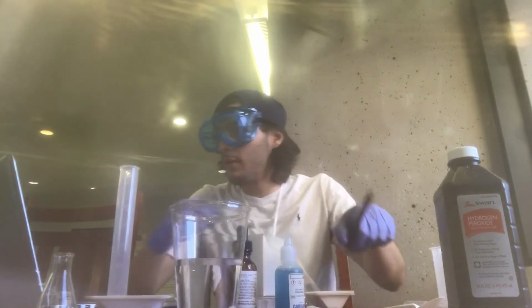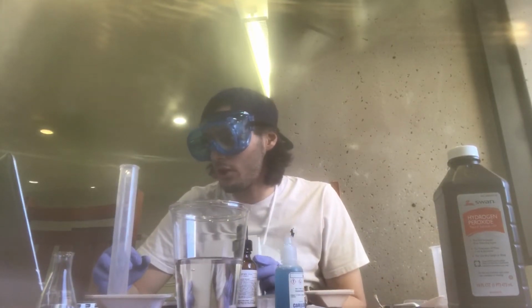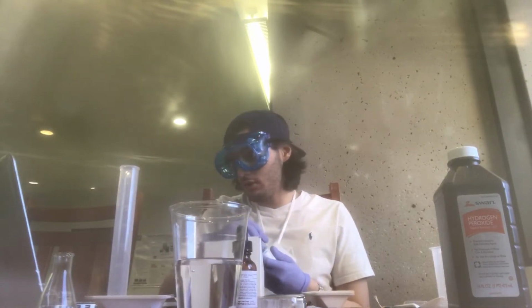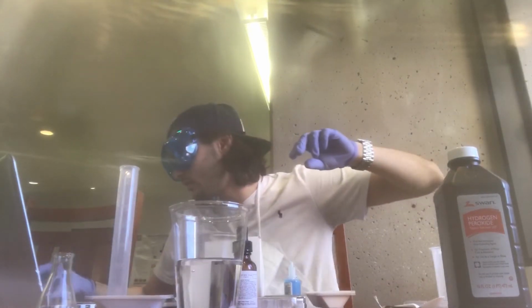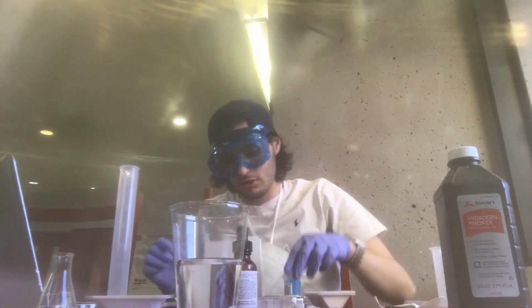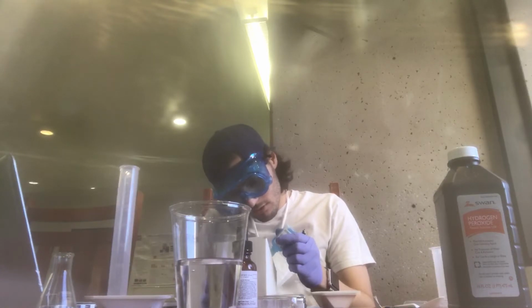Then we're going to add 2 mLs, or 40 drops, of the copper chloride to each of the 5 test tubes. I'll just use the syringe, it'll be a lot easier. That's right here. Let's drop 40. 1, 2.